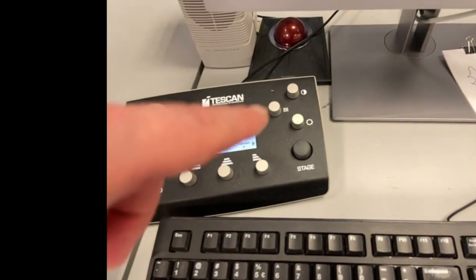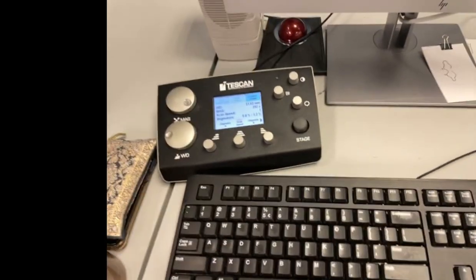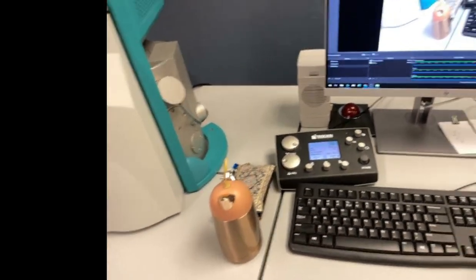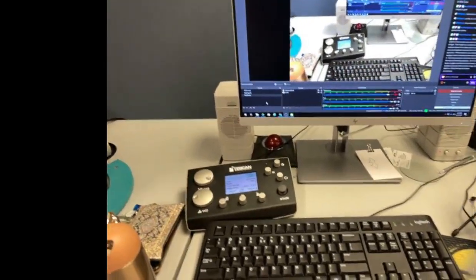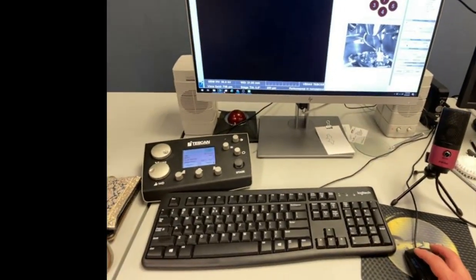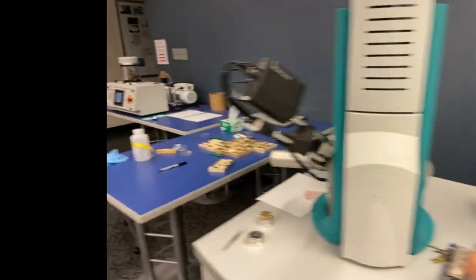You can change the beam intensity and the contrast and the brightness here, but I never do that. You can also move the stage mechanically here, but I never do that because you can just use a mouse to do it. So we don't really need to. We can control everything using just the interface. And the interface is more or less what you guys usually see. It looks something like that, showcasing almost exactly what you see when you see the stream.